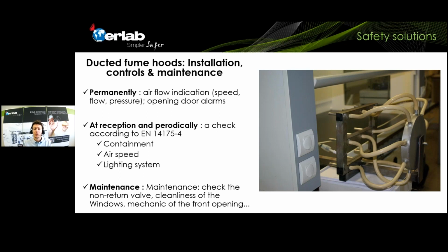When you use the methodology of risk evaluation or risk assessment in the laboratory, write that down. Say to yourself, okay, we make a planning. Every year we do this. We check the maintenance on these different safety solutions, and we do that according to regulations, for example, the EN 14175. What are the different tests that we have to perform? Do we have to ask a supplier to do that? So think about all those things and never take safety for obvious, of course. So containment, airspeed, lighting system, things you have to check in order to minimize the risk, in order to keep people safe in the lab.